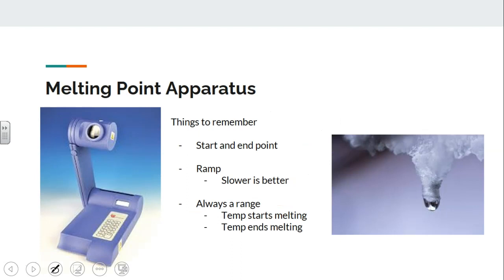It's effective. It's very effective. So here is what you get. Here is an apparatus similar to what you will see right in the lab. And what you do is you put your solid in a tiny little test tube called a capillary tube. If a test tube looks like this, and it's going off the screen, a capillary tube is very thin, and so your solid will be piled in there. And that's so that we can melt it and not have a ton of crystals to melt, and so that it can melt evenly around the whole thing.